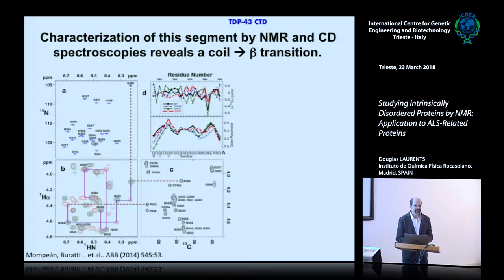And why not 8, 10, something like that? Because they will come in the cloning. But they can, in the cloning. Chances. So 4 works not very well. 12 works very well.